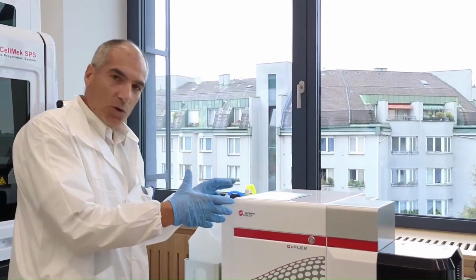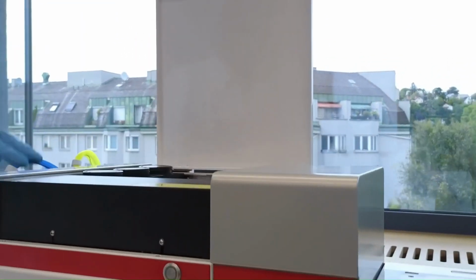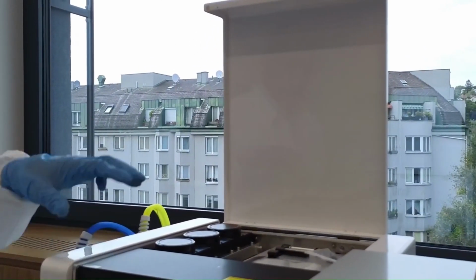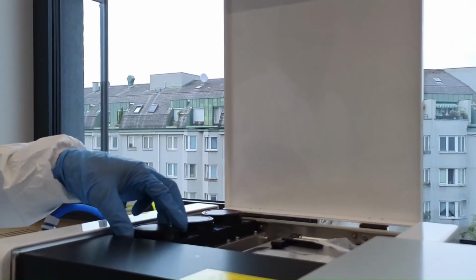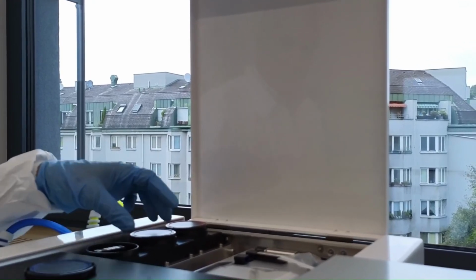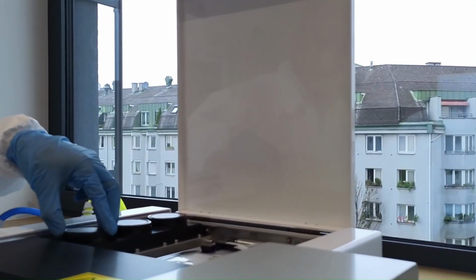Now let's have a look inside the system. If I open the cover here, the lasers are in this box, the 3 lasers: the red, blue, and violet laser. And you see here for each laser, we have the optics with the famous avalanche photodiode detectors. So each laser has its own detection module with small optical filters and avalanche photodiodes.